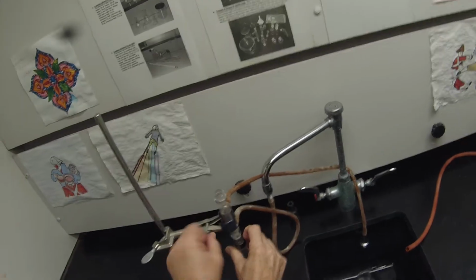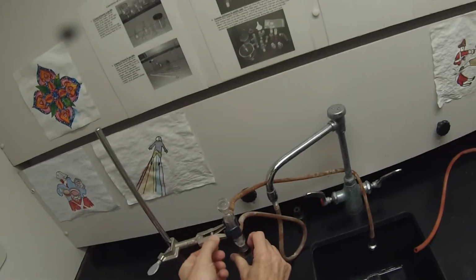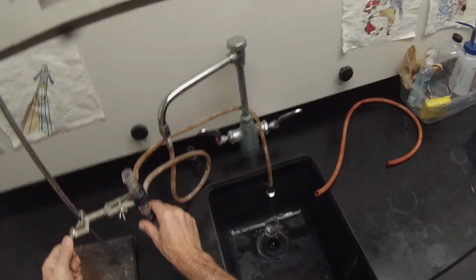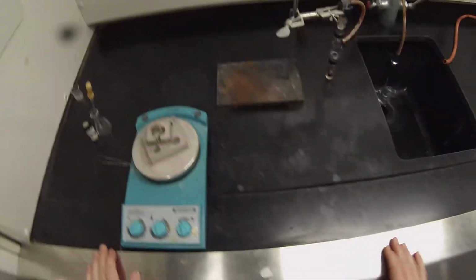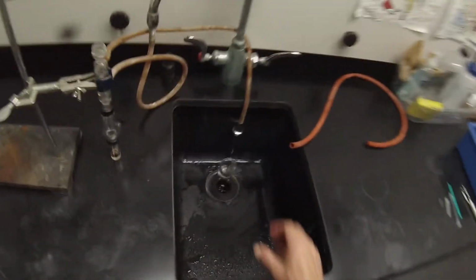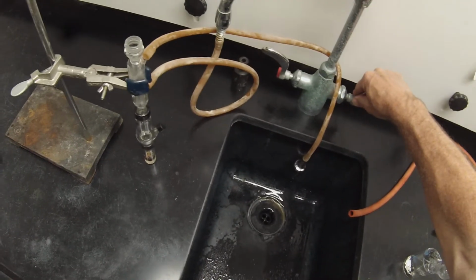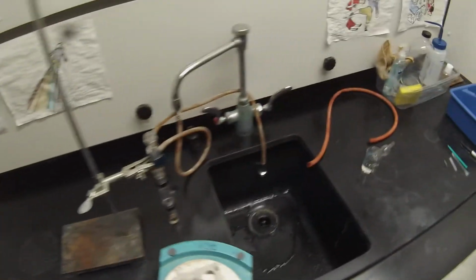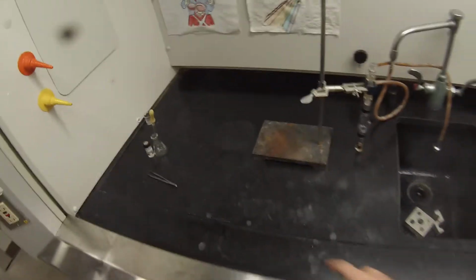So I think we'll go ahead and continue to call that done. Once I get that spin vane out of there, I think that'll be below 0.5 milliliters. Let that cool so I can handle it. All right. So I'm going to take these out of here, because I want to cool my hot blocks, and the way to cool those is to throw them in the back of the sink so I can run some water on them.